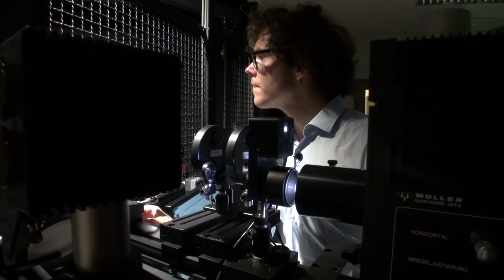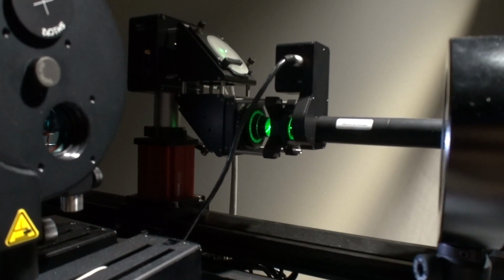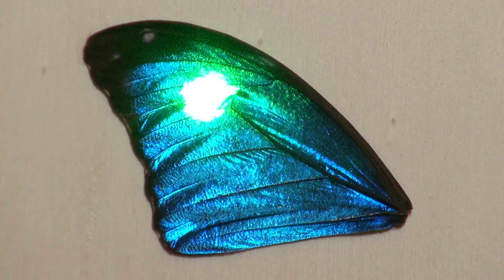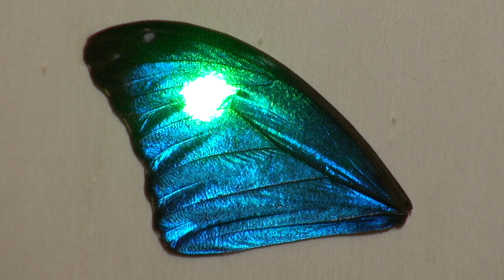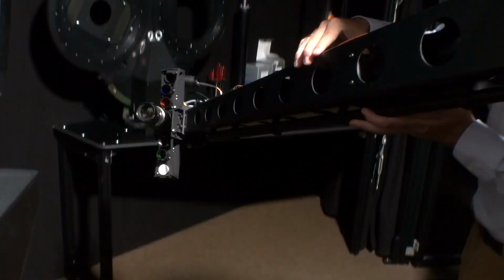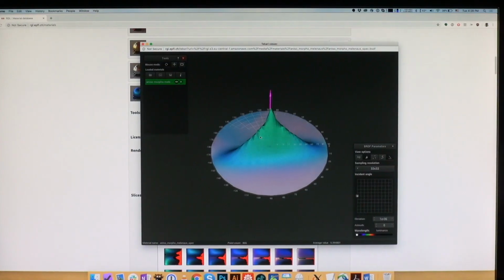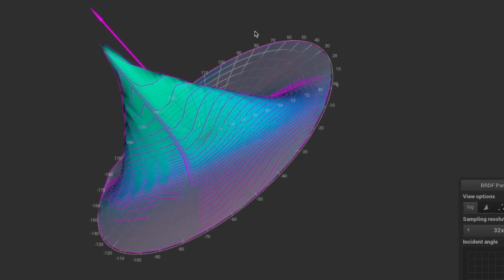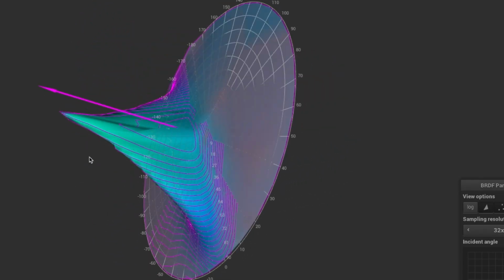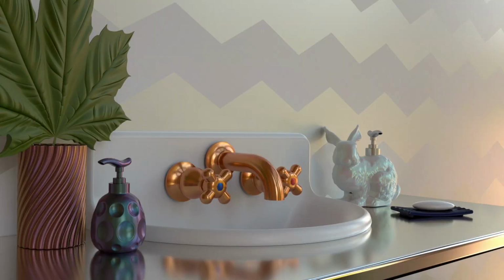One thing that's quite special about our measurement setup is that we use a spectrometer, and whereas a normal camera would just give you red, green and blue colors, which are at the end of the day the colors that we can perceive, a spectrometer now gives us also information about all the wavelengths in between. And so you get a curve that goes from the UV to the infrared, so even outside of what is visible for humans. And that gives us a lot of information to first of all describe what these materials are doing, but then also a resource that's helpful to understand what is going on and to compare them with models that already exist to understand if they're any good or if they still need to be improved later on.